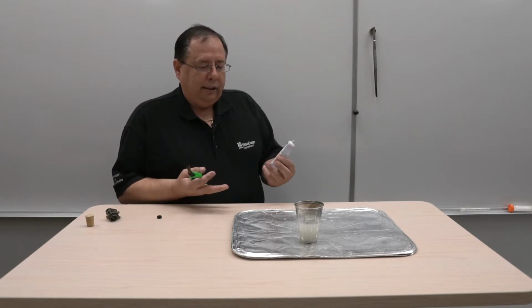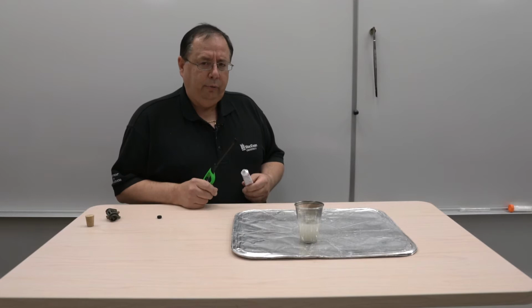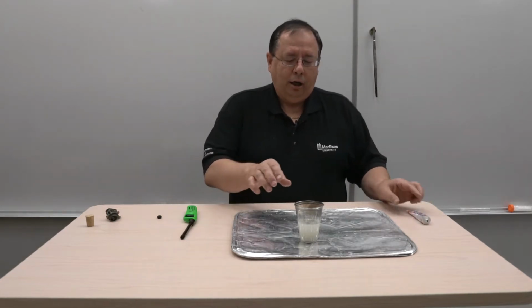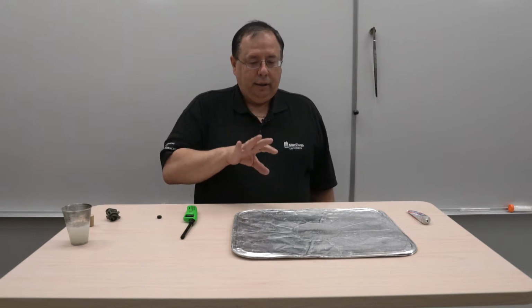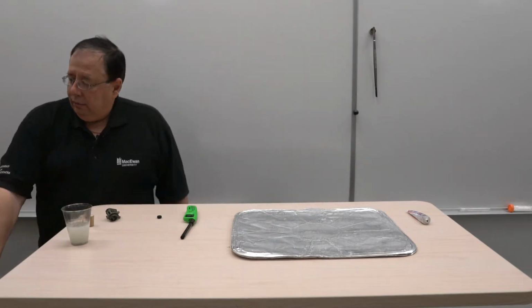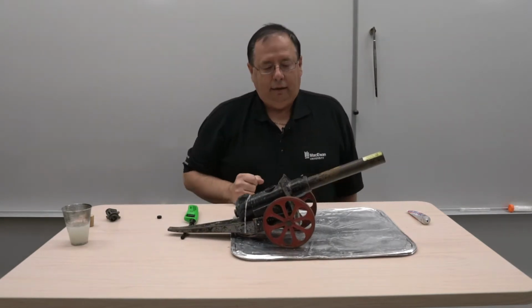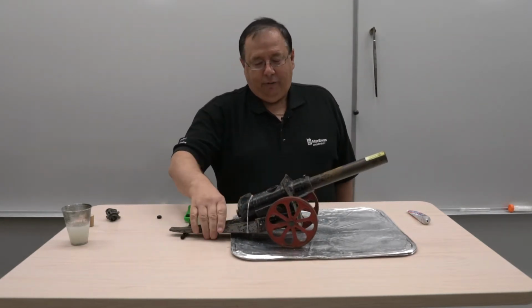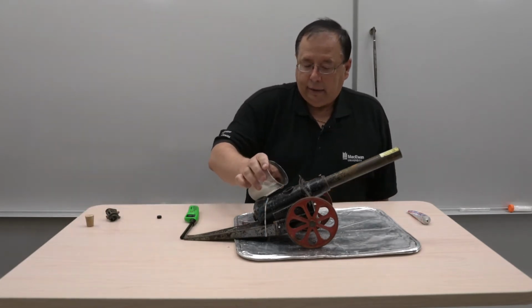So chemists look at reactions like these and they'll say, yeah, this is really cool. Can we do anything with it? Let's modify this experiment. All I'm going to do is change the container. The container that I'd like to use is this one here. Looks a little different. However, we're going to basically add water to that container.